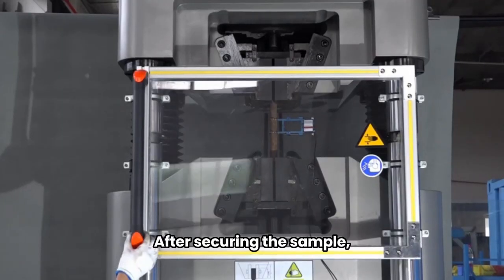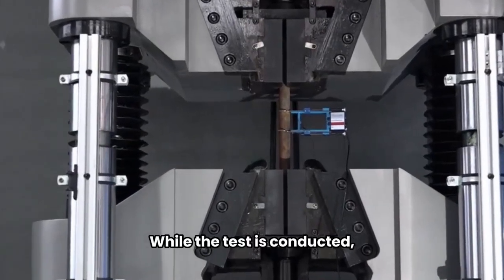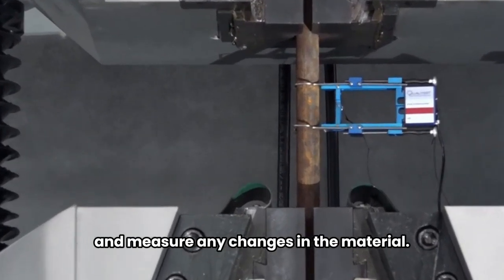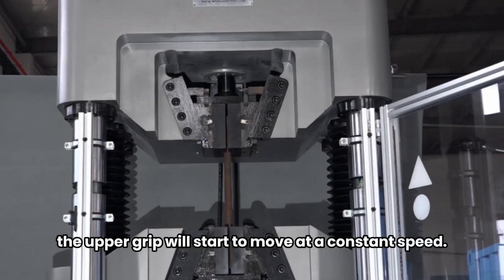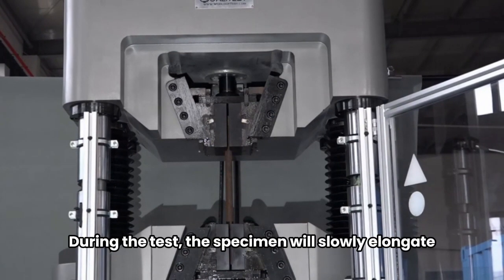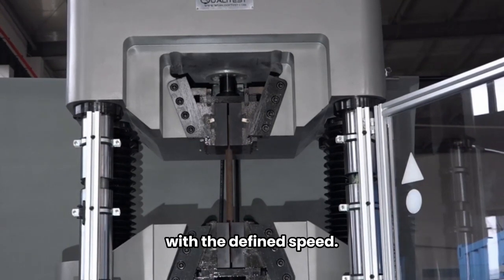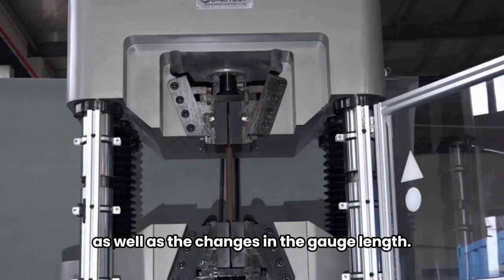After securing the sample, attach the extensometer to the sample. While the test is conducted, the extensometer will monitor and measure any changes in the material. To begin the tensile stress test, the upper grip will start to move at a constant speed. During the test, the specimen will slowly elongate with the defined speed. The data-gathering software will analyze the material's test parameters, as well as the changes in the gauge length.